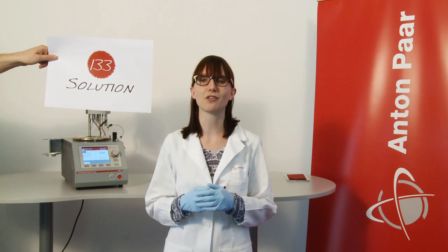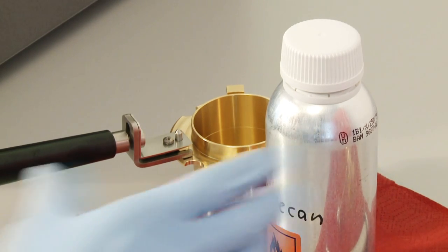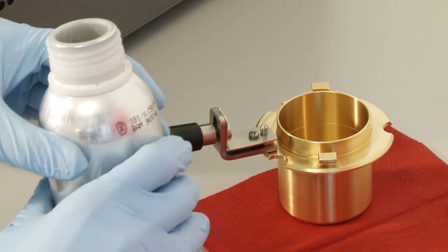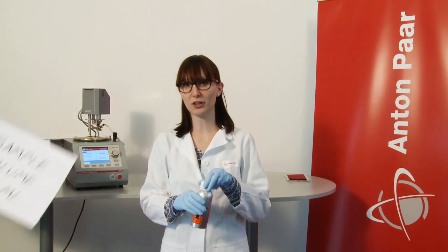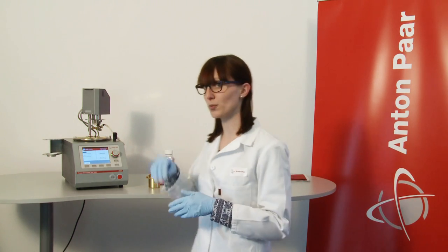This is solution number 133 of Anton Parr's 140 solutions for petroleum testing. First of all, we need some sample, like dodecane. Fill the cup with the sample up until the mark. We need a sample volume of 70 milliliters. Close the cup with this lid.